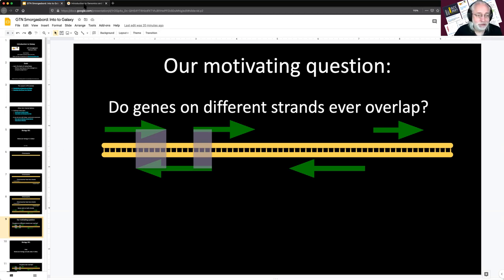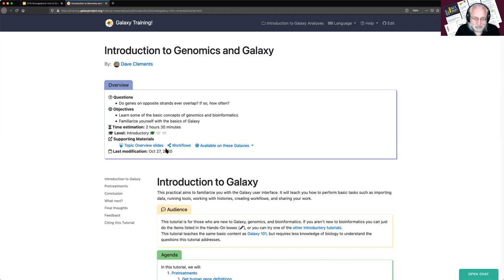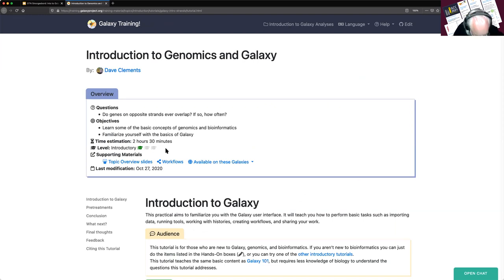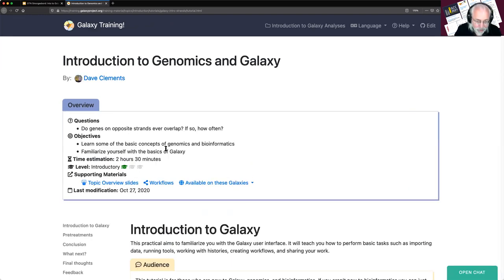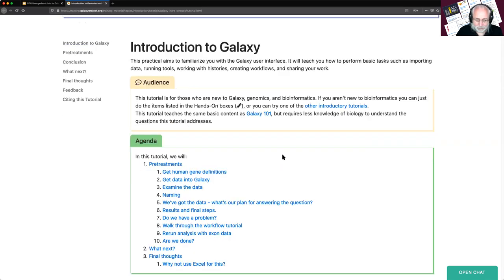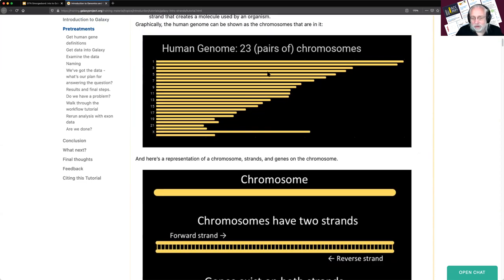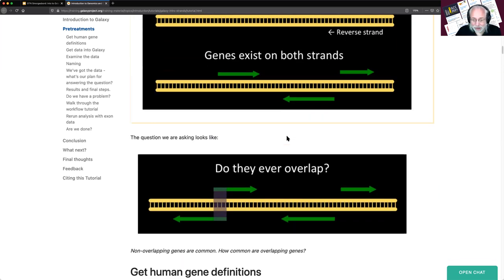So let's go to the tutorial. This is our tutorial — Introduction to Galaxy in Genomics. It talks about what our motivating question is, all the definitions we covered, and here's the relative lengths of the 23 pairs of chromosomes in humans. We're going to look at chromosome 22 because it's short and this is a workshop.